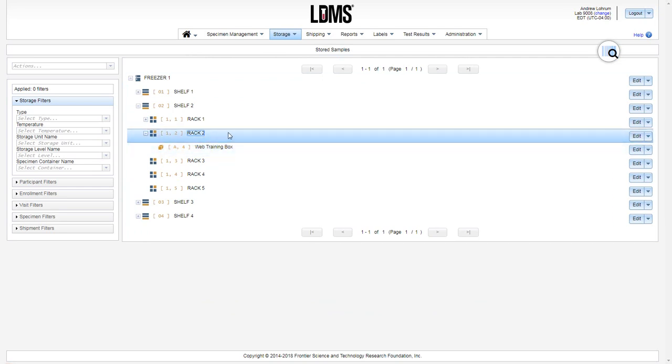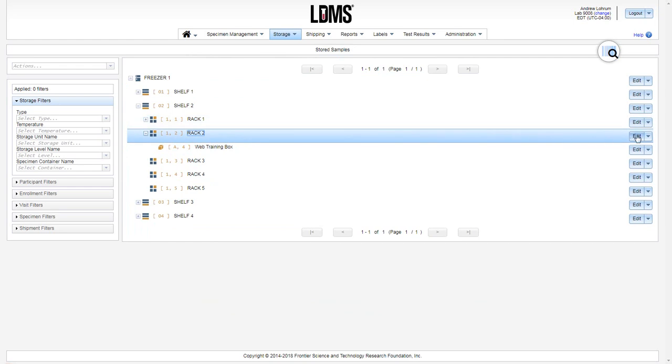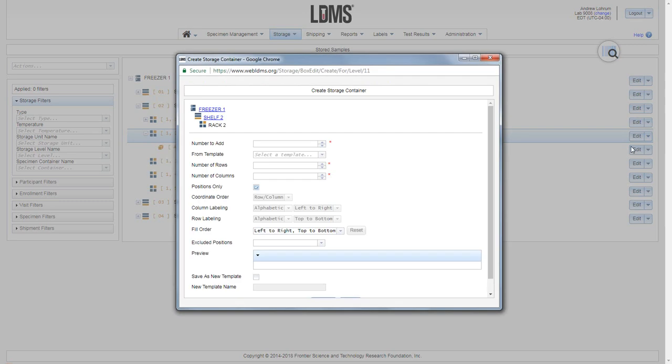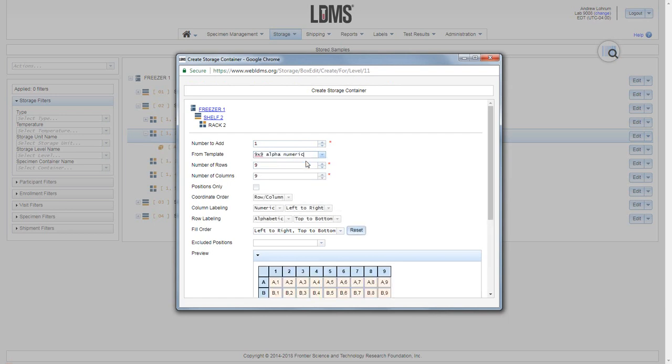If you wish to utilize the template, simply use the drop down menu, add new container, choose the number of containers to add, and then simply choose the template from the menu.